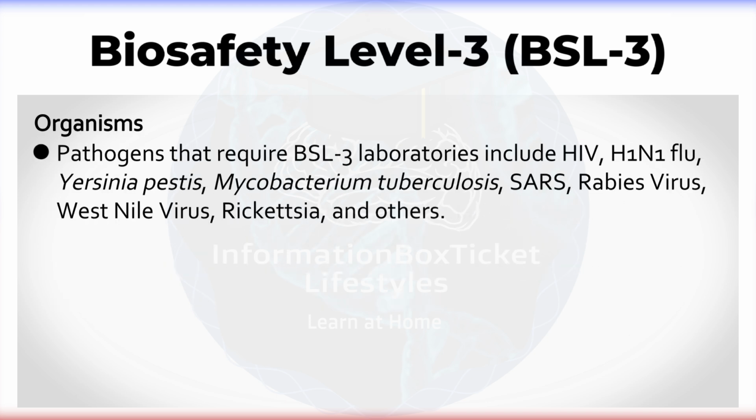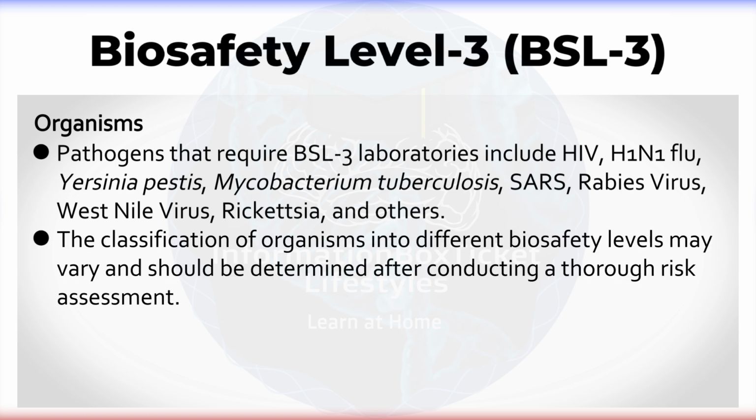Organisms. Pathogens that require BSL-3 laboratories include HIV, H1N1 flu, Yersinia pestis, Mycobacterium tuberculosis, SARS, rabies virus, West Nile virus, rickettsia, and others. The classification of organisms into different biosafety levels may vary and should be determined after conducting a thorough risk assessment.